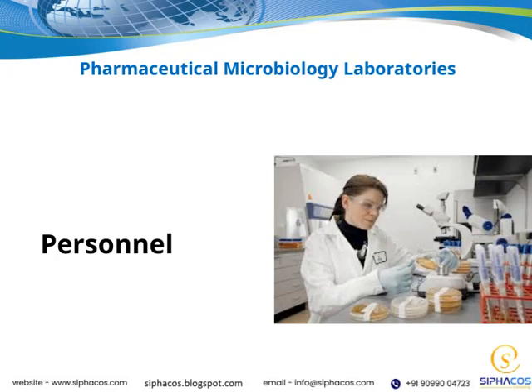Let's take a closer look at the personnel involved in pharmaceutical microbiology laboratories. These laboratories rely heavily on skilled professionals who are trained specifically to handle microbiological testing and ensure the quality and safety of pharmaceutical products. Their expertise is crucial because they are responsible for detecting and controlling microbial contamination, which directly impacts patient safety. The personnel typically include microbiologists, laboratory technicians, and quality assurance staff.